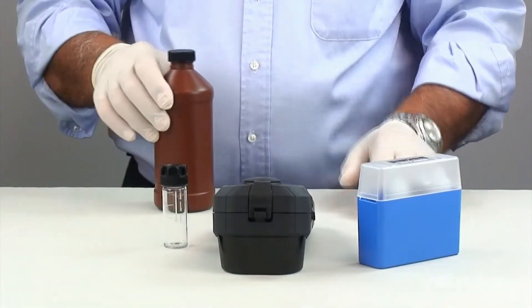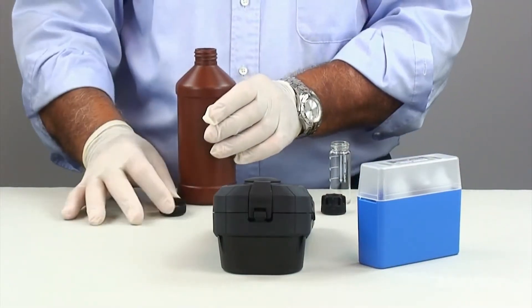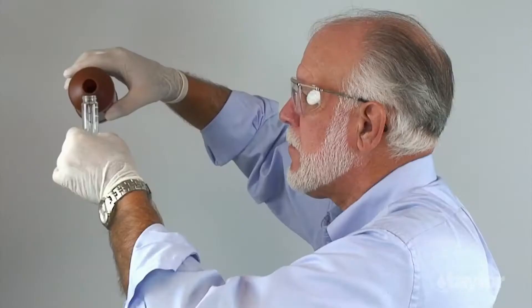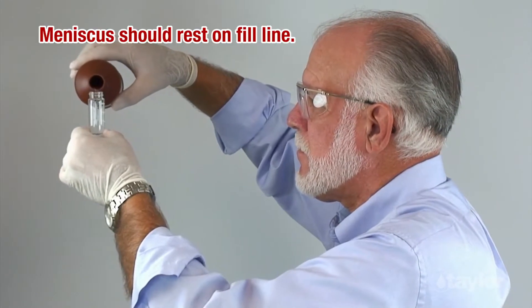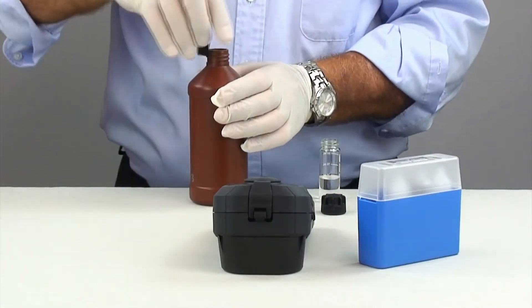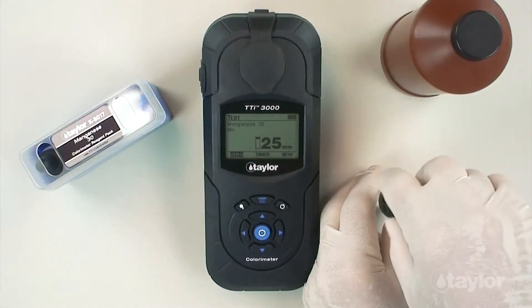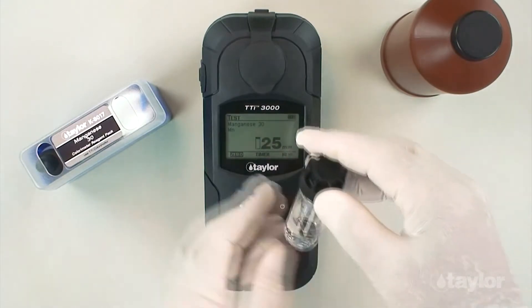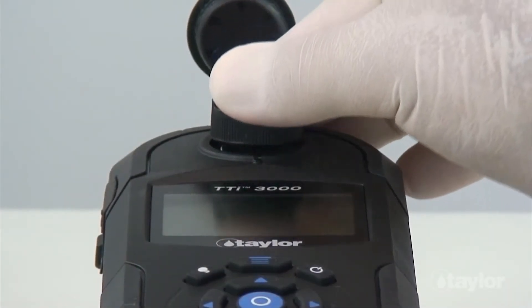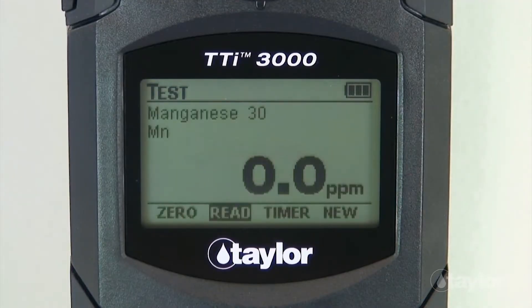Rinse and fill the 25mm sample cell to the 10ml mark with the sample, then cap. Insert the sample cell into the sample cell compartment, aligning the marks on the cell with the notch on the sample cell compartment, then gently push down. Select zero using the scroll arrows, then press enter. Zero will be displayed on the screen.